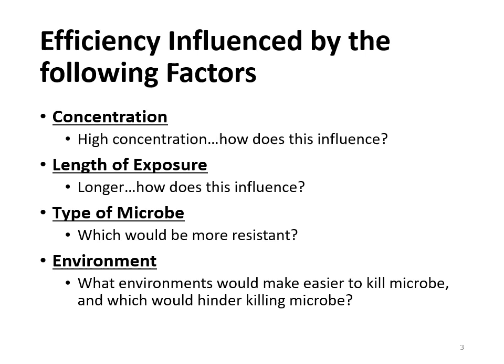An environment that would instead make it easier to kill microbes, for instance, might be heat, extra heat, having flame present, okay? That helps kill microbes. Or simply having less organic matter. That's an environment that helps make it easier to kill the microbes.